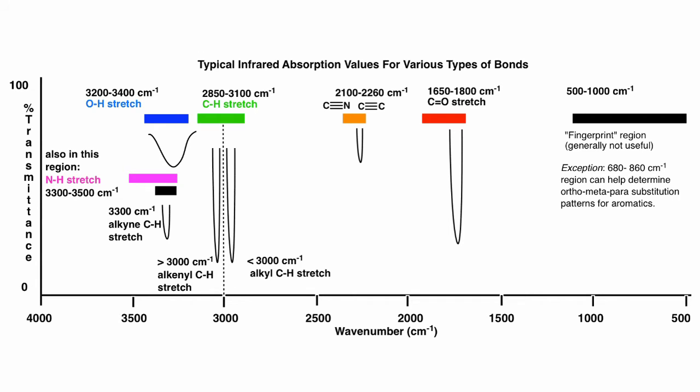Alright, now that we've purified benzaldehyde, what we need to do next is make sure that we actually have benzaldehyde. To do this, we can run two tests. The first is checking the infrared spectrum, or the IR spectrum. By exciting the chemical with infrared light, we're able to see different stretches or different motions of the bonds in the chemical that correlate to different functional groups. Here are some of the most useful peaks that you'll see in an infrared, and what functional groups they correlate to.